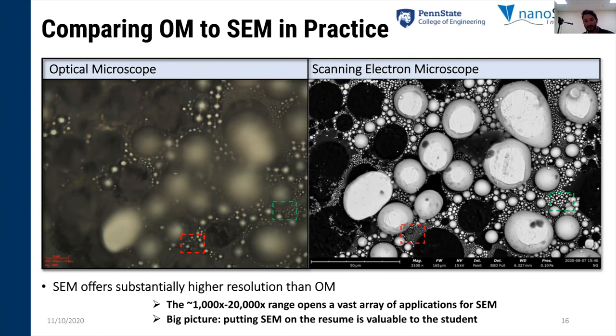More so than most techniques. As you guys know, in nanotechnology education especially, there are dozens and dozens of different pieces of equipment we teach our students. But I would honestly rank SEM at the very top of that list, along with optical. It's very important as well for students to have as skill sets for their resume.